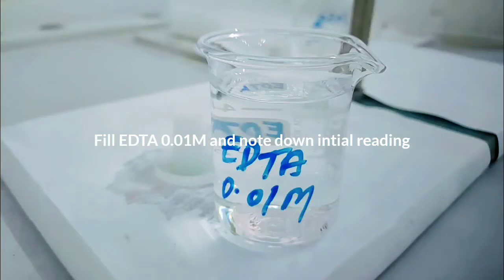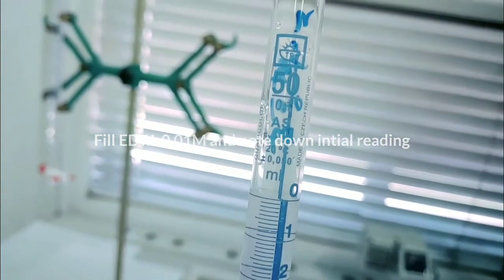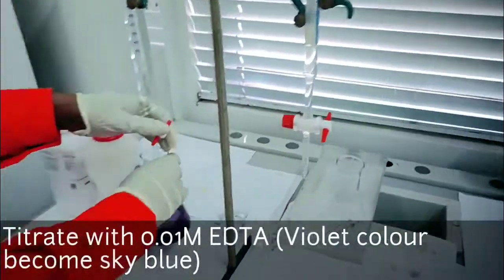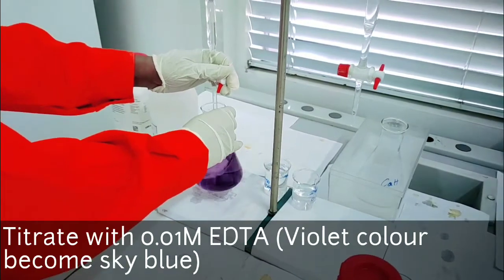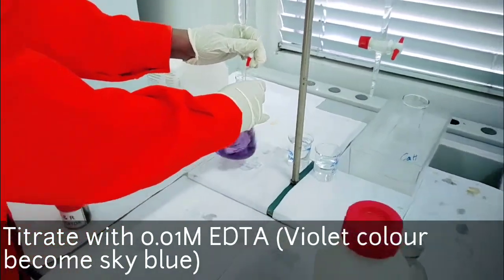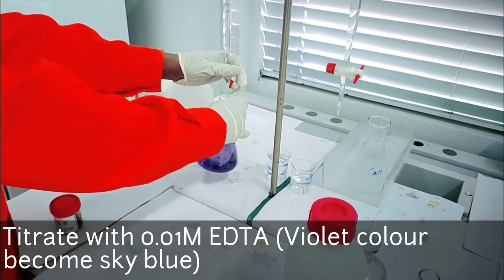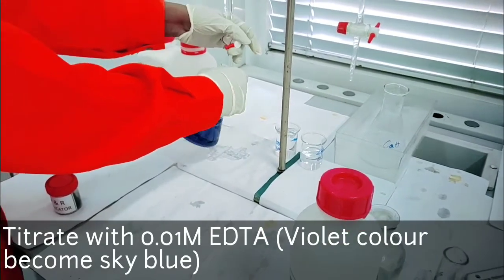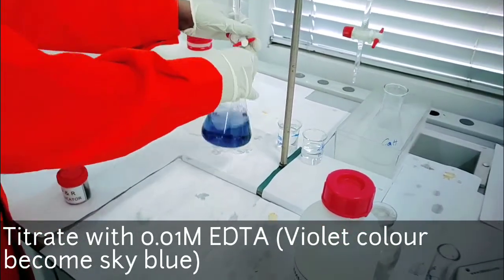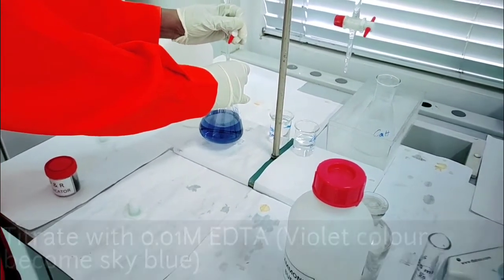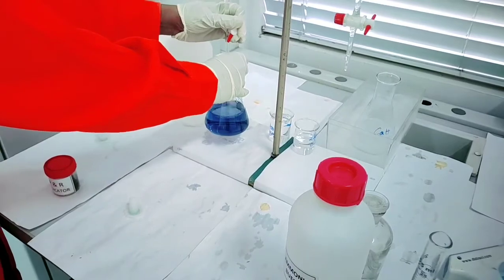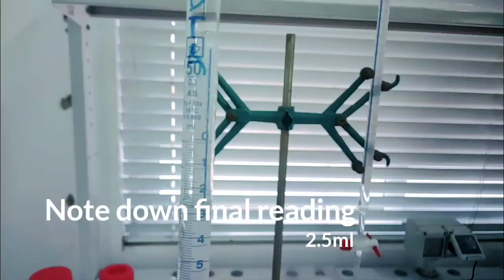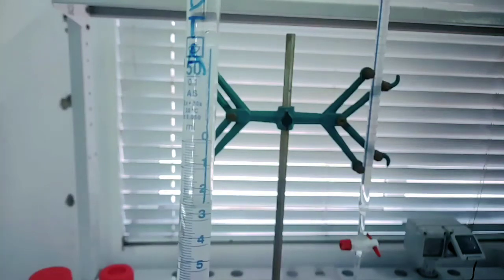Use 0.01M EDTA. Note down the initial reading. Color can become violet color to sky blue color. Note down the final reading, it is 2.5 ml.